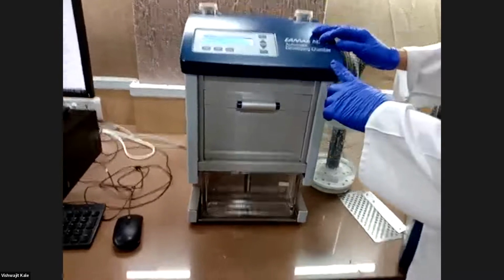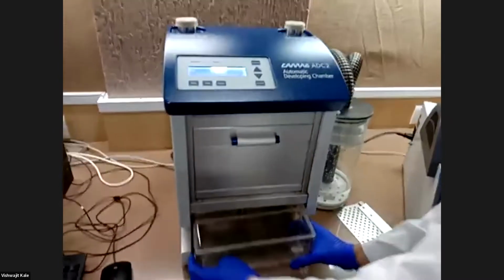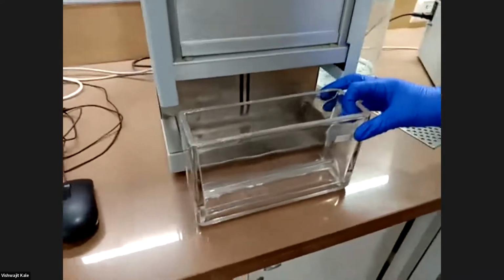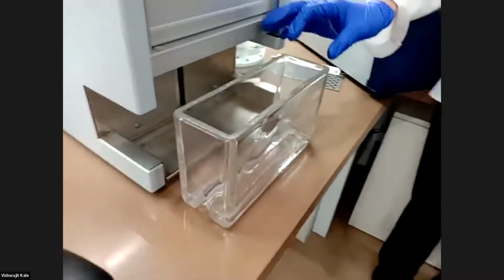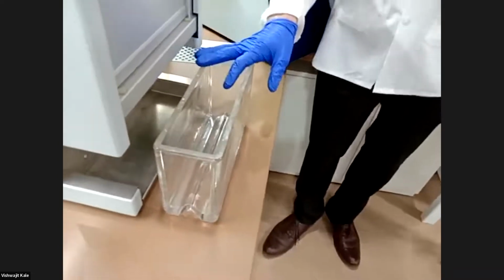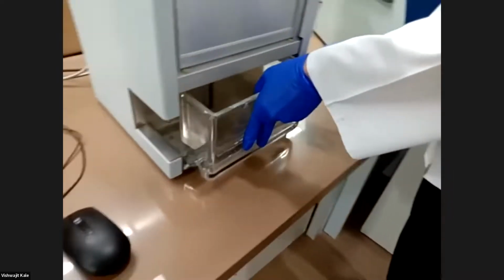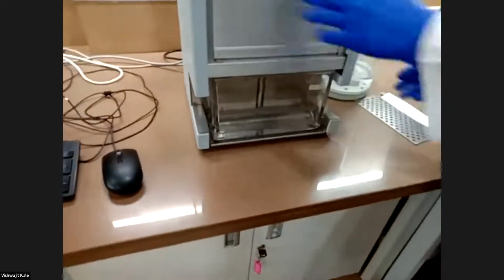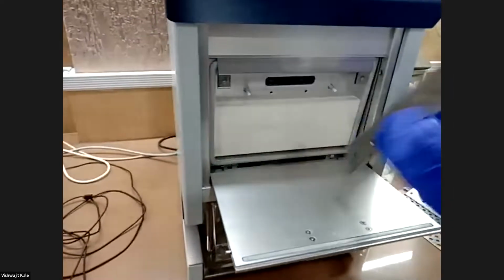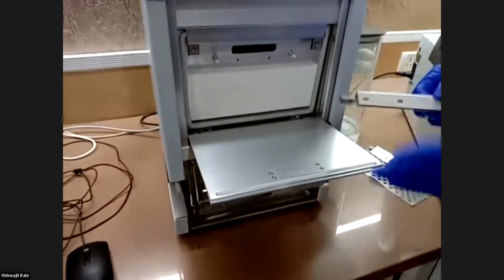So this is CAMAG ADC2 development chamber. If we see, this is coming with this twin trough chamber having dimension 20 by 10. So any plate having dimension 20 by 10 or less than that, we can keep in this chamber and we can develop in this chamber. So if we keep this chamber here along with saturation pad, and if we hang the plate here at the upper part of this ADC2, we need to hang our plate here.